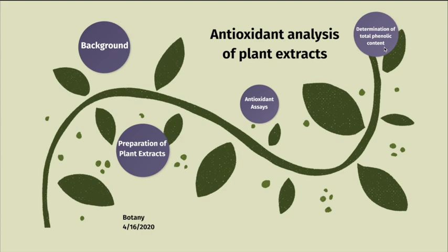Hello and welcome to another Botany 199 video. In this edition, we'll briefly review the purpose of our antioxidant experiments, our experimental procedures, and our results. Then we'll analyze our datasets, visualize our data, and draw conclusions about the antioxidant capacities of our plant extracts. So let's begin.